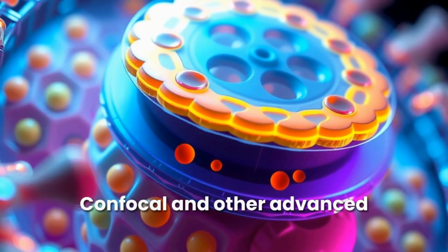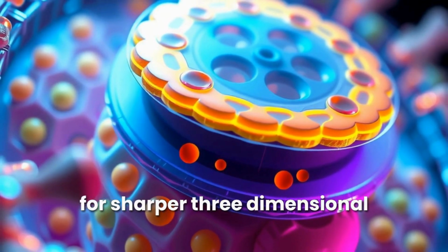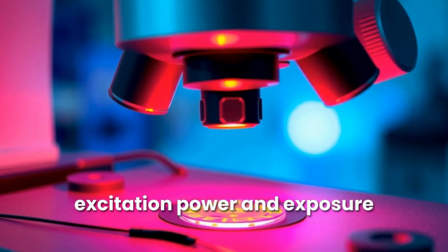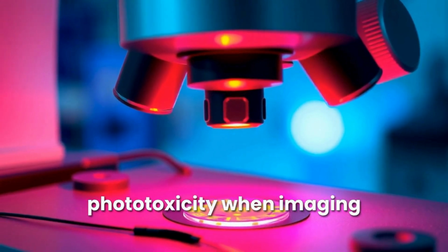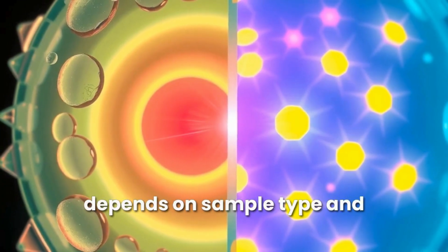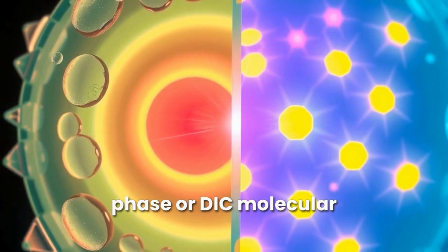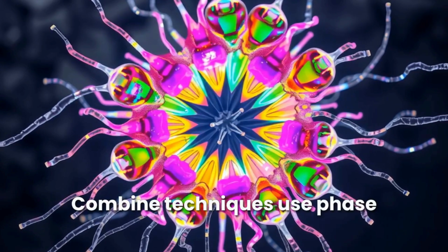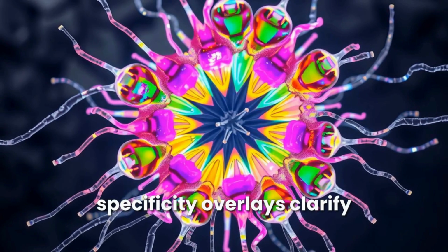Confocal and other advanced systems use optical sectioning, rejecting out-of-focus light for sharper three-dimensional reconstructions. Careful choice of dyes, excitation power, and exposure prevents photobleaching and phototoxicity when imaging living specimens. Choosing the right modality depends on sample type and question. Live dynamics favor phase or DIC. Molecular localization favors fluorescence. Combine techniques. Use phase contrast for context, then fluorescence for molecular specificity.